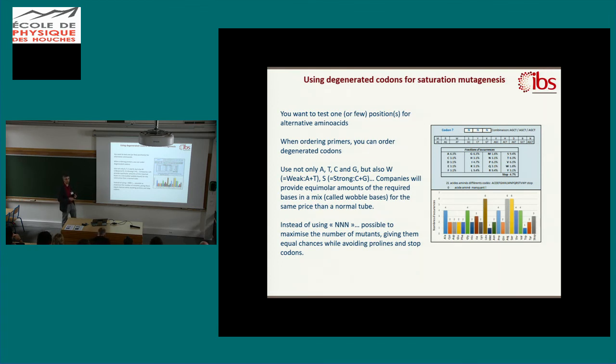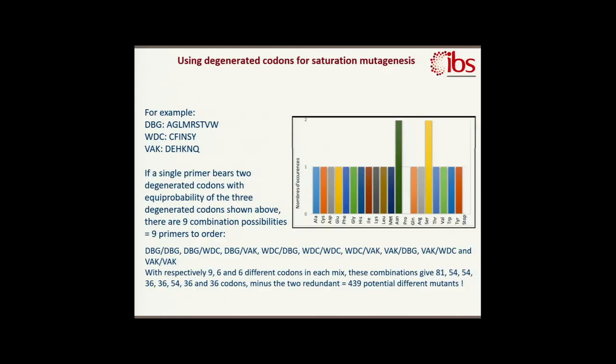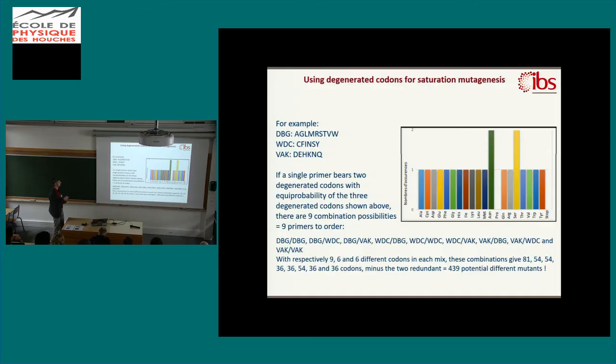And it will give you all the chances to have the three stop codons. So maybe you want to avoid that. And you can do it, for example, by this combination of codons when you order. It's the same price if you order. It's important to know because it's the cheapest way of mutating that I could find.